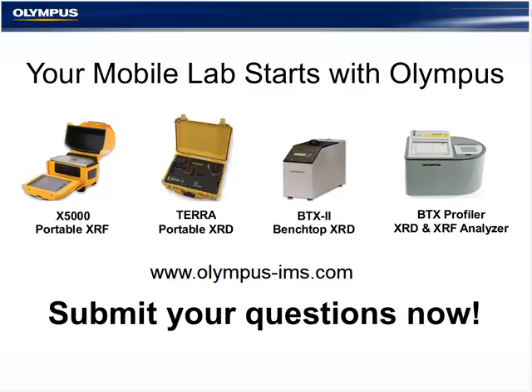So after they're clean, it's really important that you don't destroy some of the fragile minerals and clays inside your sample. It's best to air dry a sample at low temperatures. When you're crushing, it's best done by hand. Although a lot of these minerals seem really robust, you can actually break them down pretty quickly. And so the sample prep is the most critical part of a great diffractogram later.